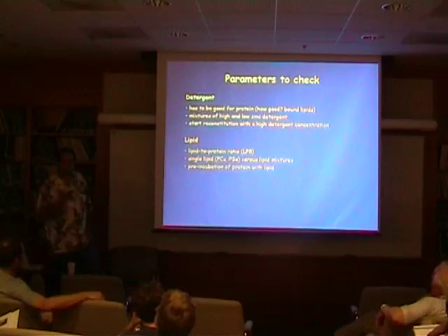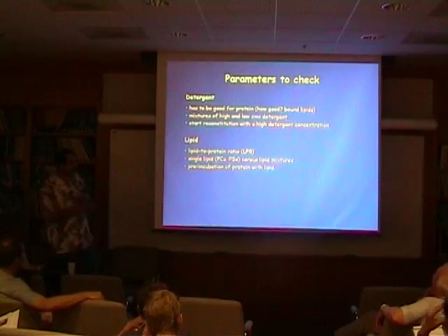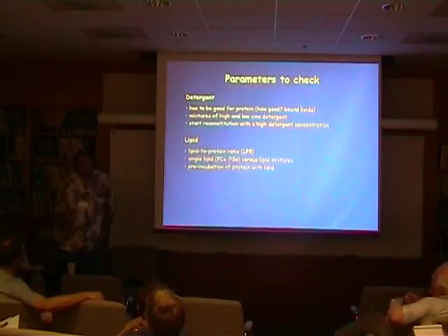I don't believe that pre-incubation of a protein with a lipid, so you make it in detergent, you leave it overnight, and then you start the dialysis the next day, makes a big difference. To me, there's no big difference whether you actually do this or you just immediately mix and start the dialysis. But then again, there are groups that say that only if you pre-incubate the protein with a lipid, you get reconstitution, otherwise with certain proteins you don't. What the basis is for that, I can't tell, but there are just observations like this.